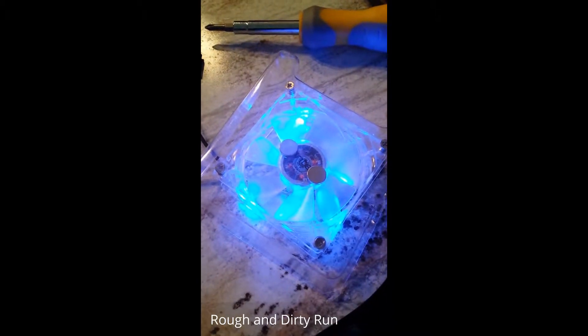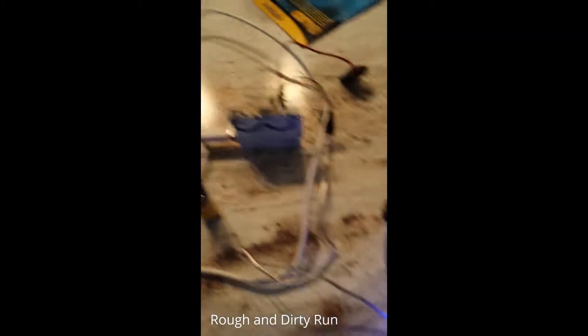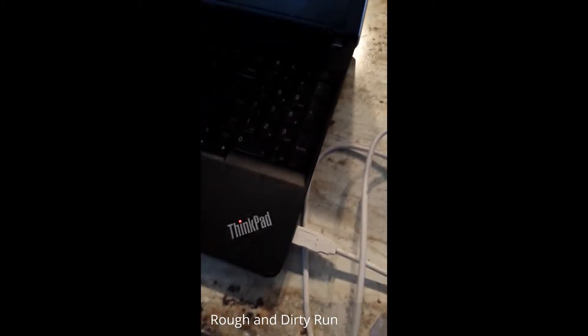I bought a PC fan and super glued two magnets into it. I'm powering it from an Arduino that's connected to my laptop.